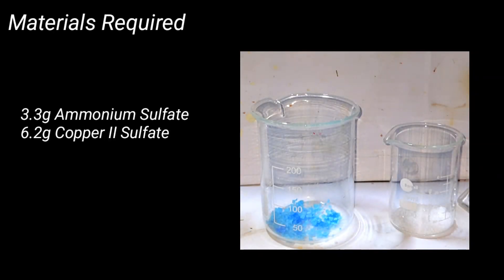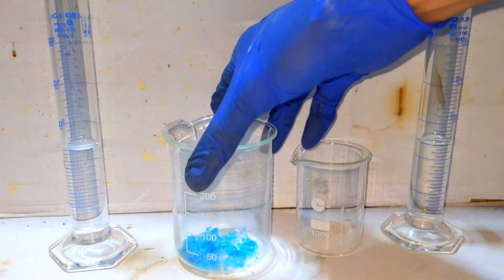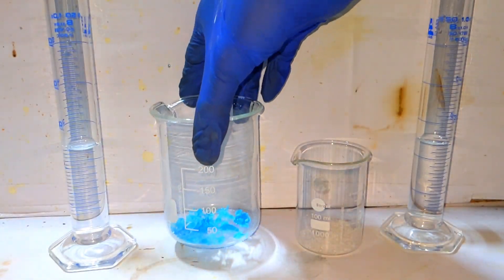Materials required for this preparation include 3.3 grams of ammonium sulfate and 6.2 grams of copper 2 sulfate pentahydrate. Here we have the ammonium sulfate which is colorless and copper 2 sulfate pentahydrate which is blue in color.